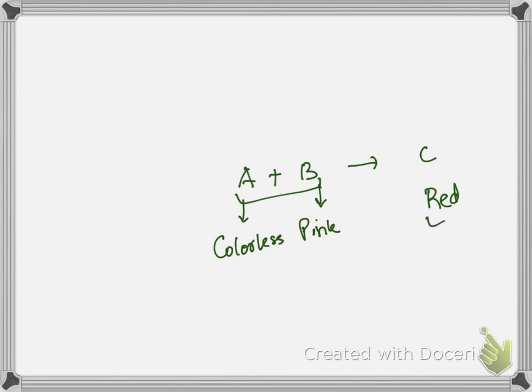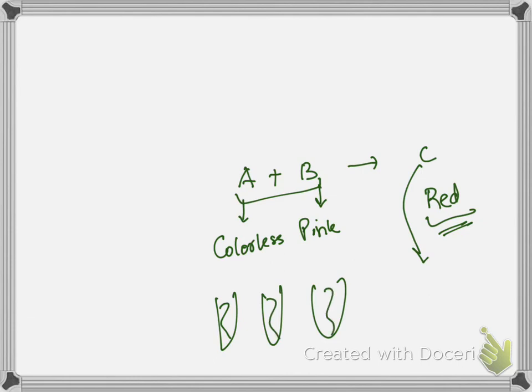Now let's say you diluted this C with water, and then you are putting that solution in 3 test tubes. When you are diluting it, the color is going to get slightly lighter. And you have this solution in these 3 test tubes. First one is control. In the second test tube, let's say you're putting 1 drop of A, and the color gets darker.